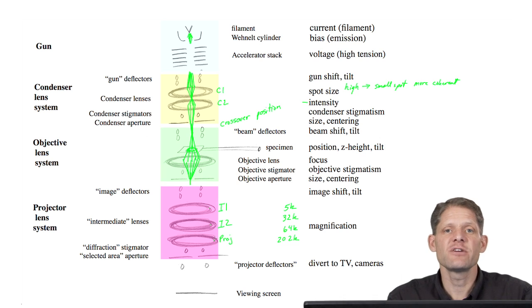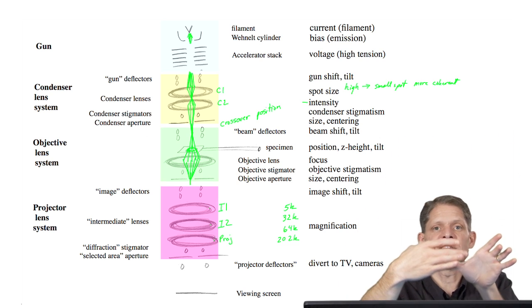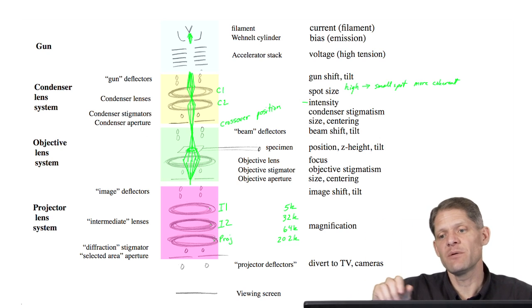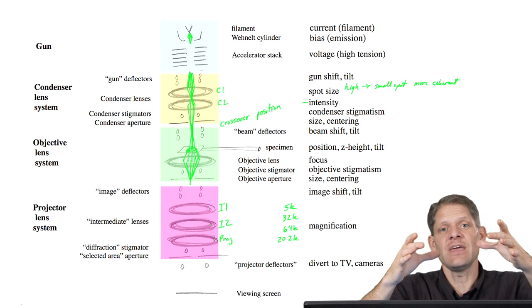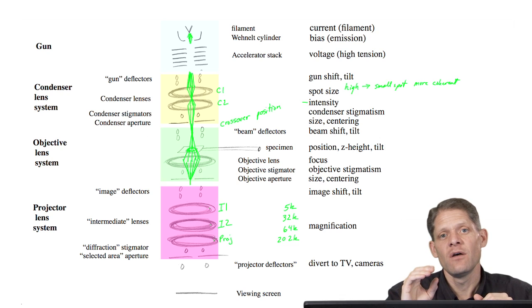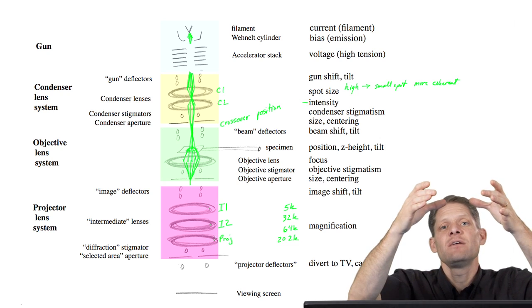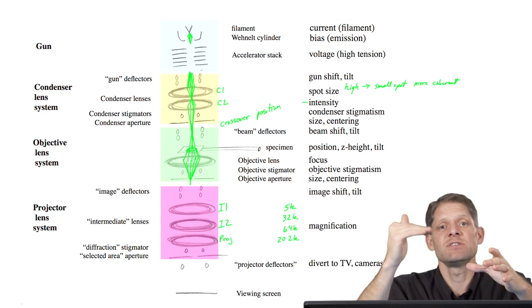Remember that electron microscope lenses, as they form an image, rotate it as it moves through the lens. And so it's advantageous to be able to move up and down through magnification without having the image rotate wildly. By having these preset magnifications, all of the lens currents can be chosen so that each time the image is not rotating much from one setting to another.